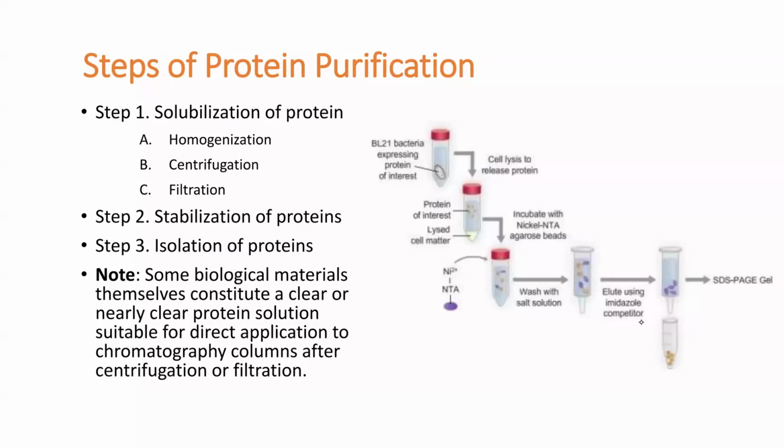It disaggregates the tissue into individual cells. Then you can get the individual cells and put them in a suitable isolation media. After that, you open up the cell, and every content of that cell will be released into the suitable isolation media.